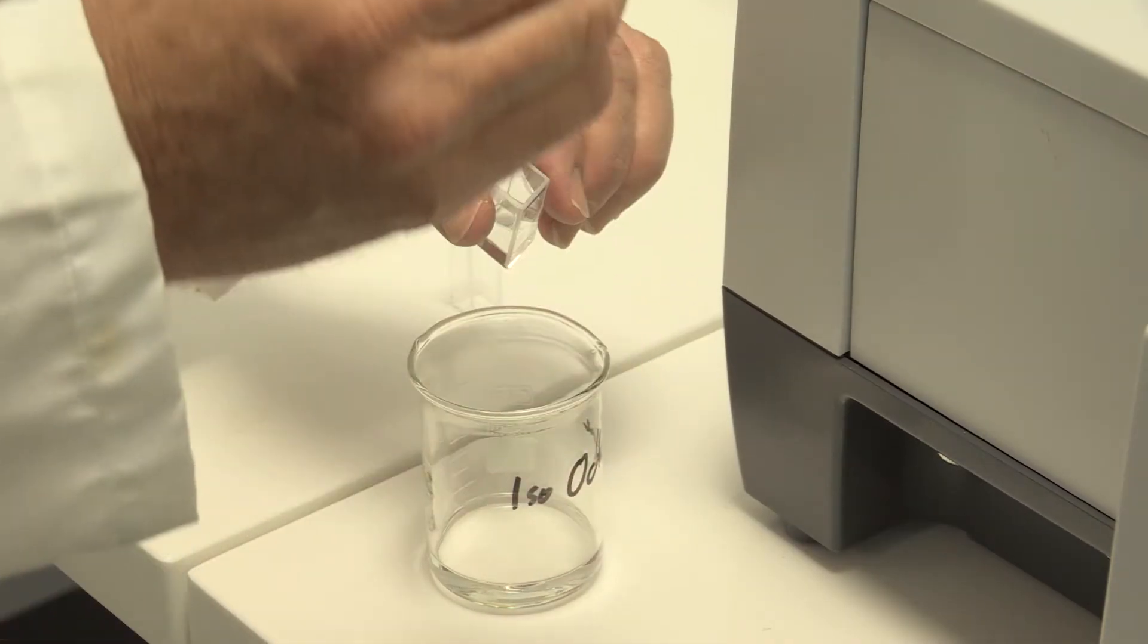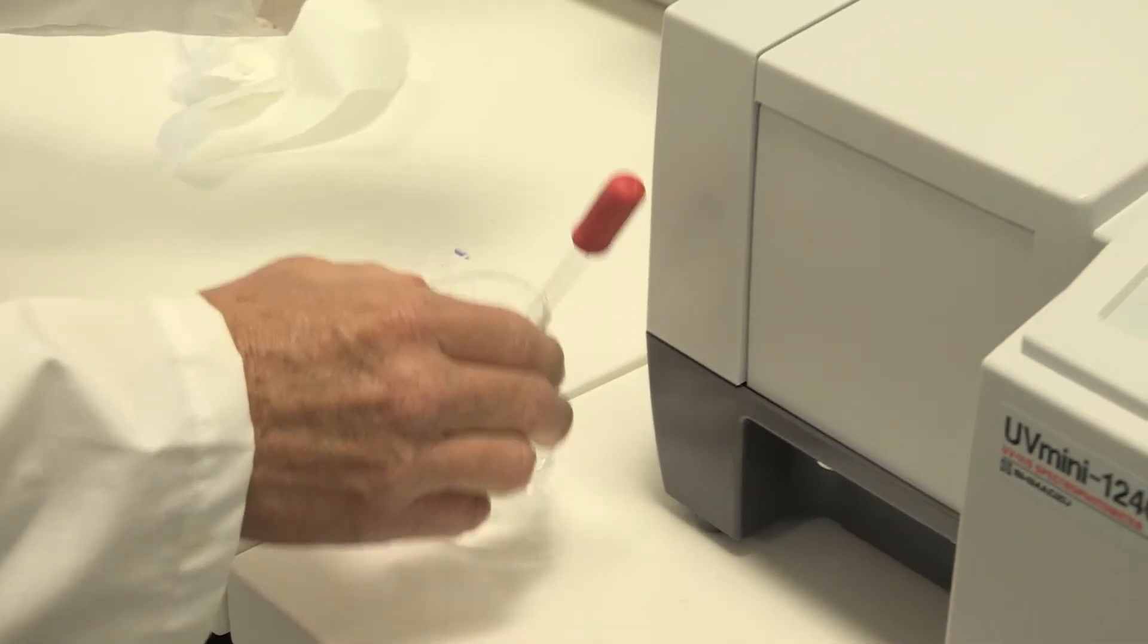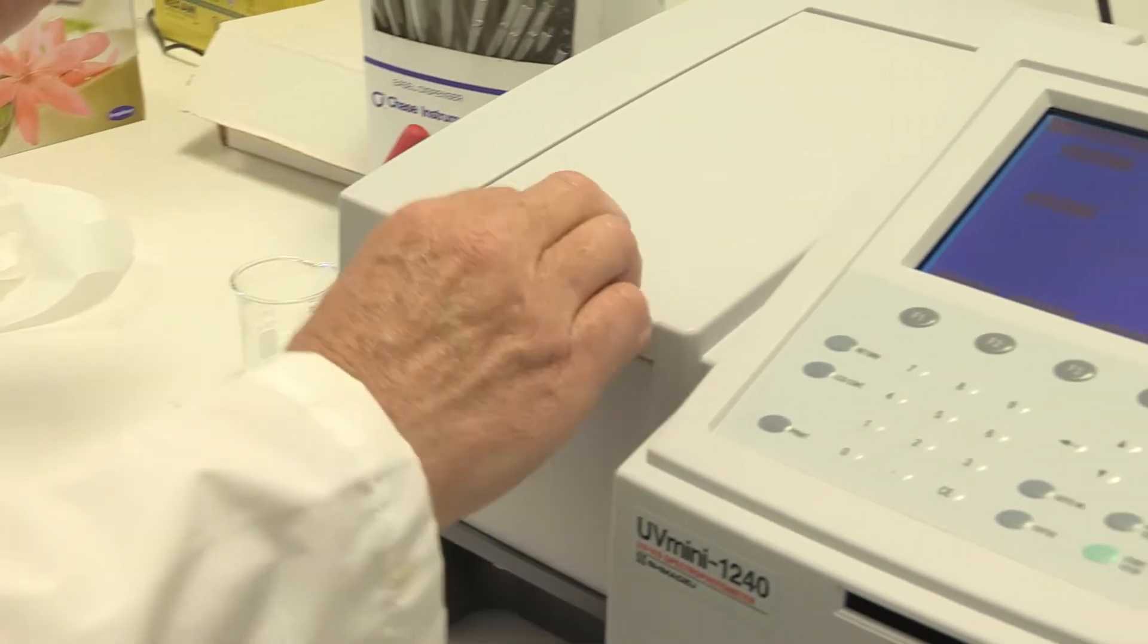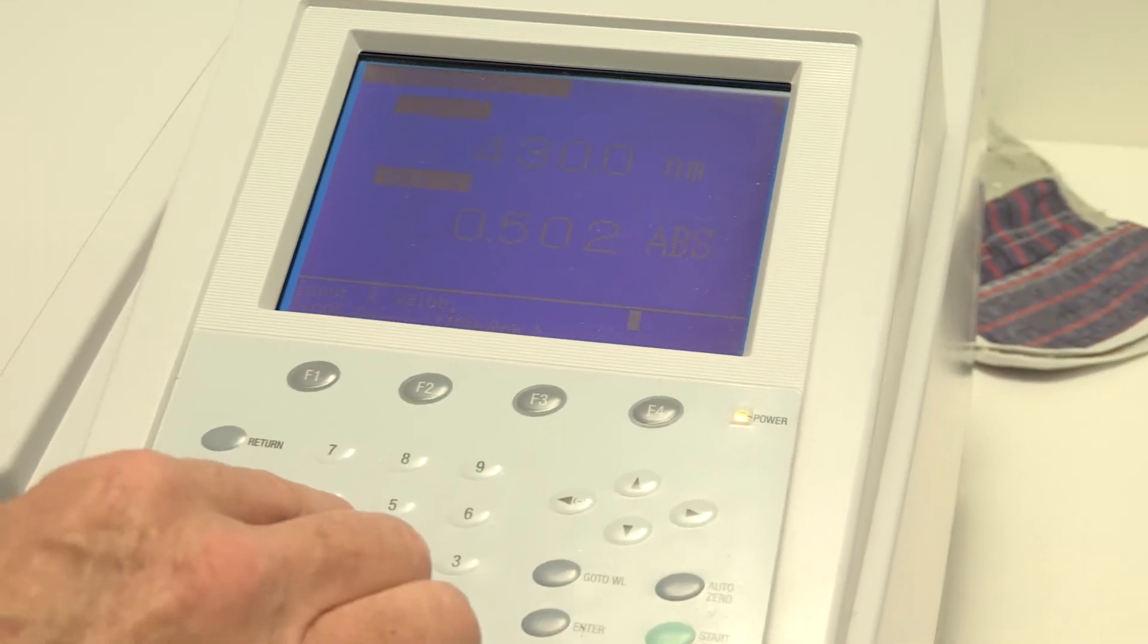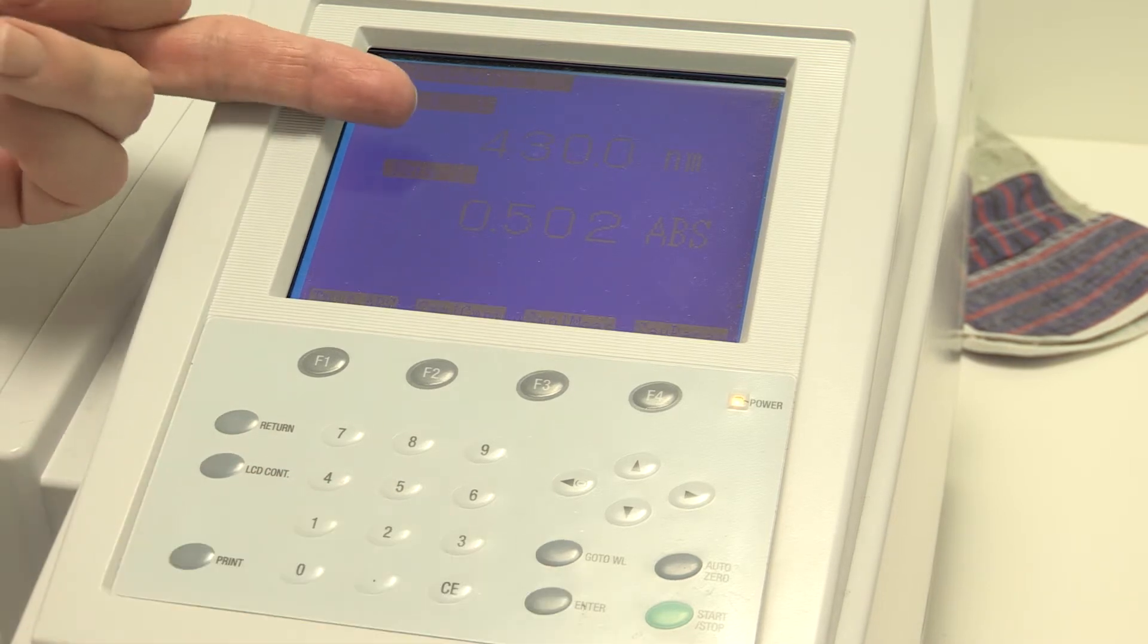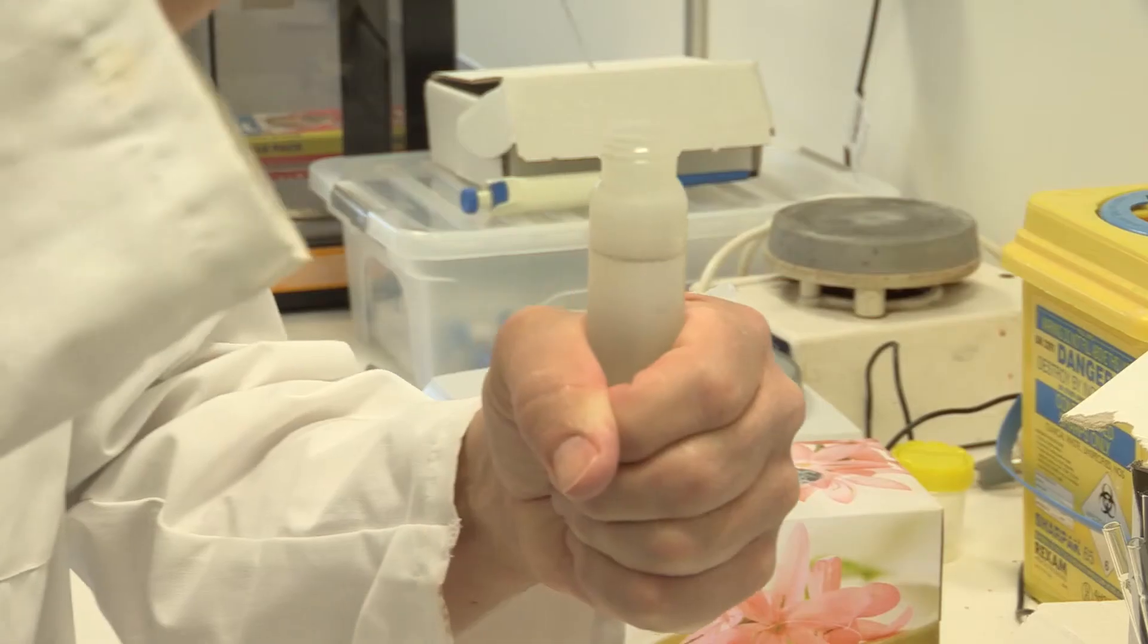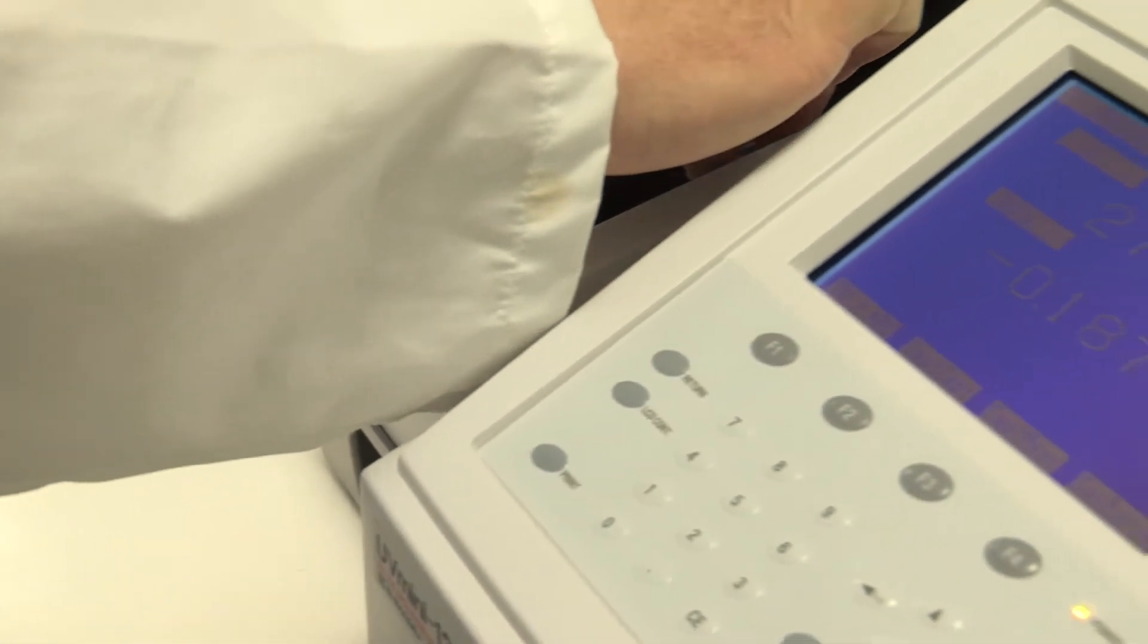Our spectrophotometer is zeroed against iso-octane using a quartz cuvette. The quartz cuvette allows us to read in the UV spectrum. The spectrophotometer is set at 275 nanometres and zeroed, and then we read the iso-octane that we have used to extract our beer with.